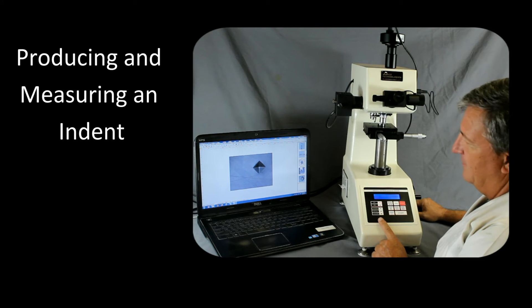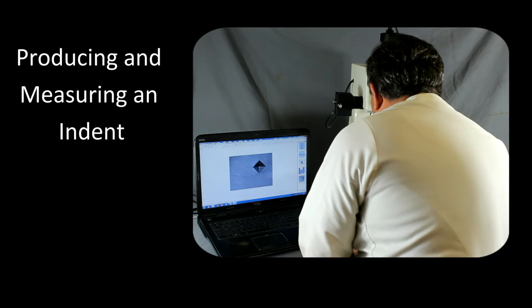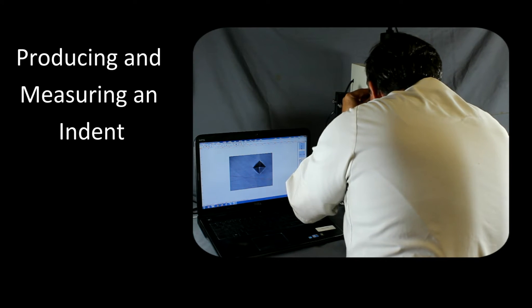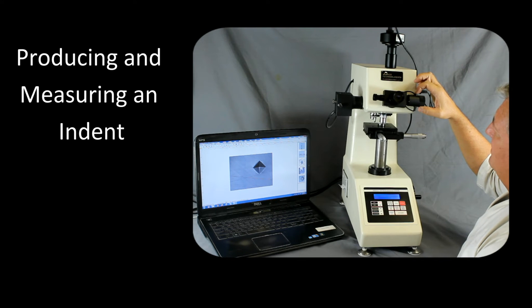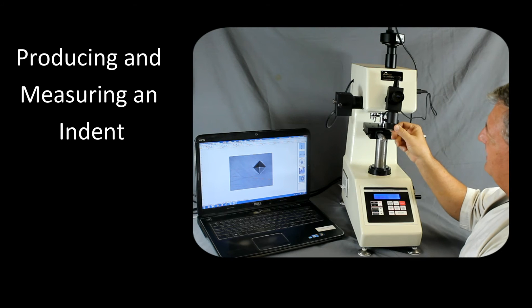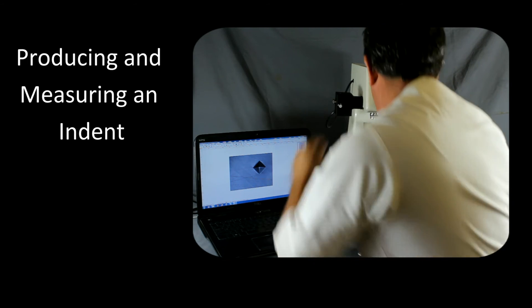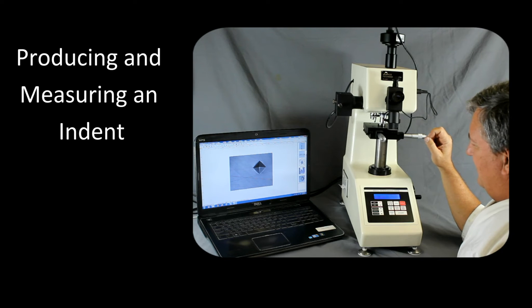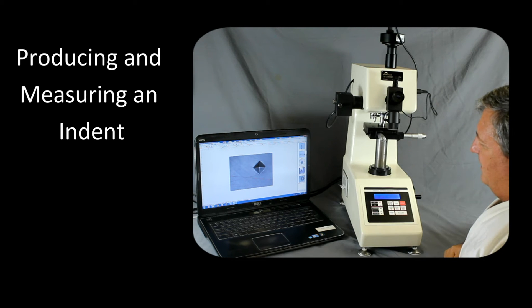It automatically shifts over to the objective. Now we can go ahead and focus a little bit better on the indent. Using the filar, we want to bring the left edge of the filar to the left side of the indent and then open it up to measure the other side. After the indent is within the filar, we push this button to accept that value. For Vickers, we rotate 90 degrees and measure the other two diagonals, then press the button again. You'll hear it beep when the measurement is accepted. Here we're getting a measurement in Vickers.